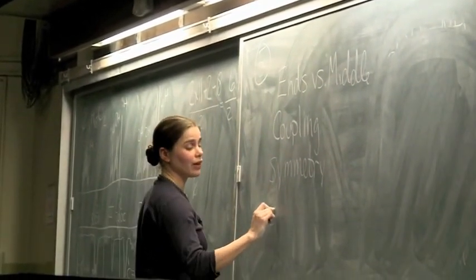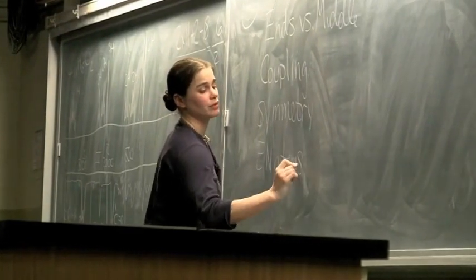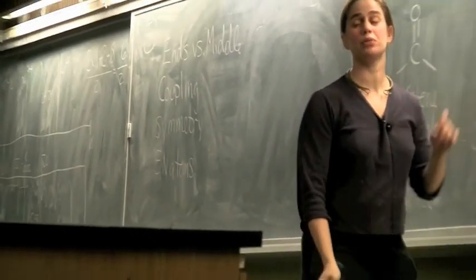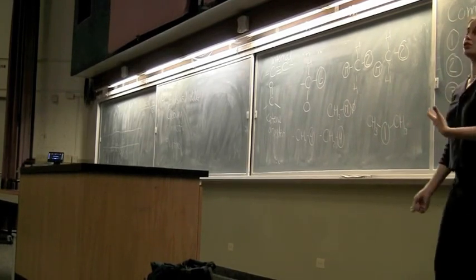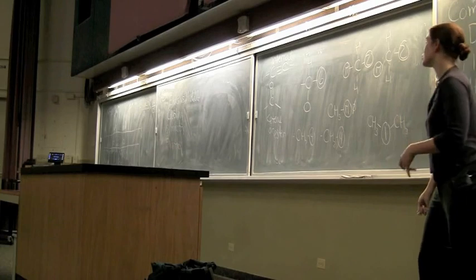Look for electronegative atoms. Who else is next to that oxygen? In fact, that's probably where we're going to start with this one: who else is next to that oxygen? There's not a lot of good places to put that oxygen where it's not going to show you some sort of weird chemical shift. It needs to be something that has no hydrogens attached.